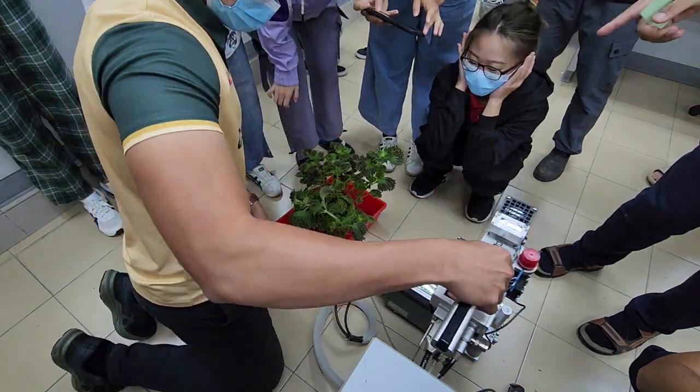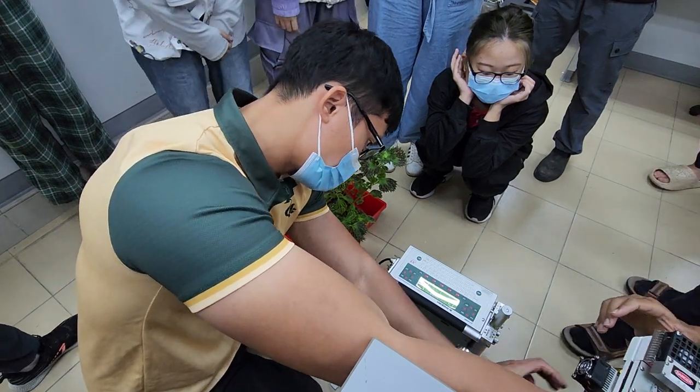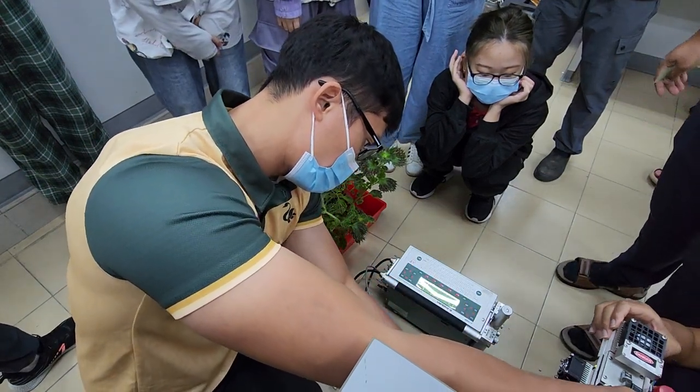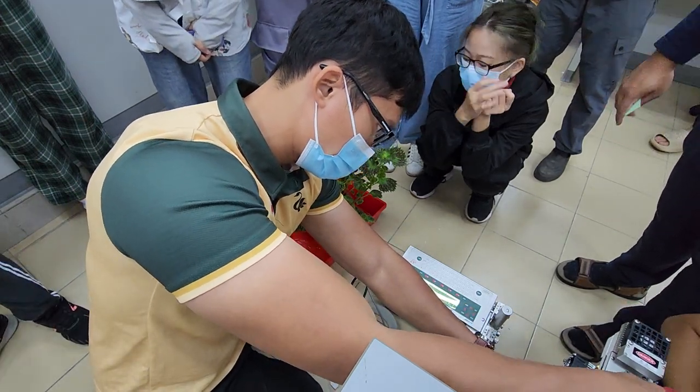And it's a bit tricky because this is a shade plant, plus it's variegated. It's not like a regular green plant. Maybe you can take one green plant, completely green, no variegation.